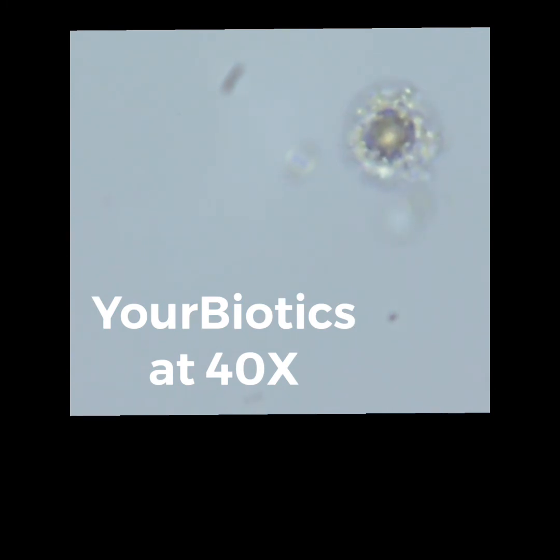You see all this glowing going on with a little bit of movement. All of these microbes work together. They are the archaea and the probiotics. They are working together, igniting energy amongst each other and with the cell to create a universe. It's that simple.